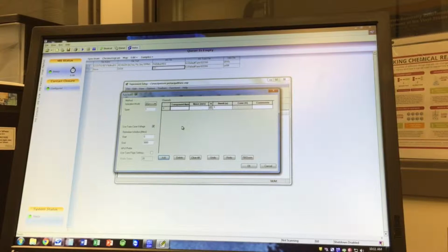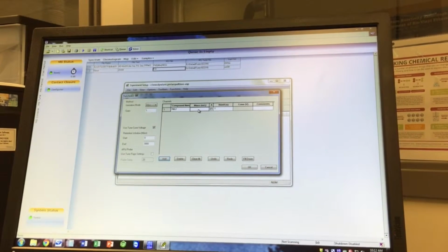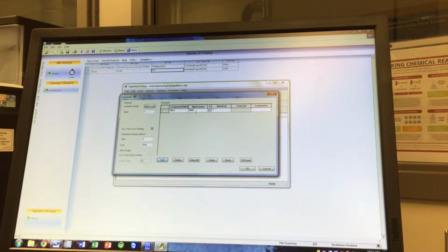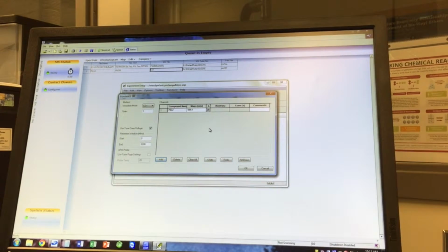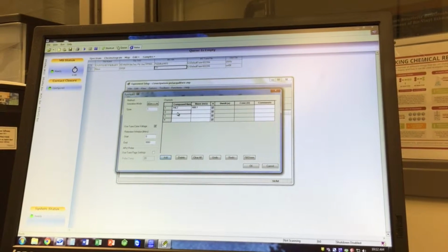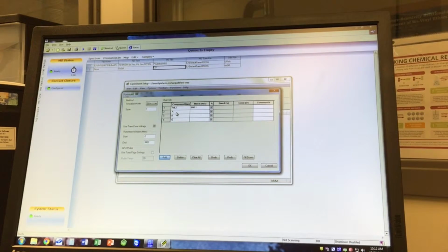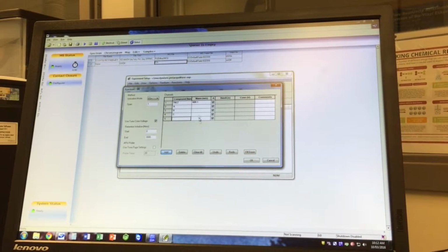So for example, I could be looking for my palladium complex with 2 ligands bound. I could punch in its mass, let's say it's 608.1, and I can give it an amount of time to dwell on, or I can tell the system to just automatically choose its dwell time based on however many compounds I choose to add at the bottom. Maybe I want to add another compound, another compound, and another compound. This is all embedded in the same SIR file.